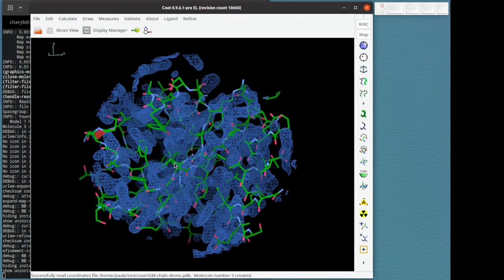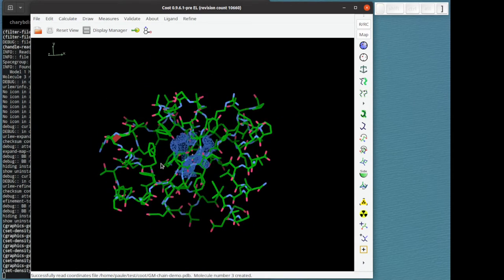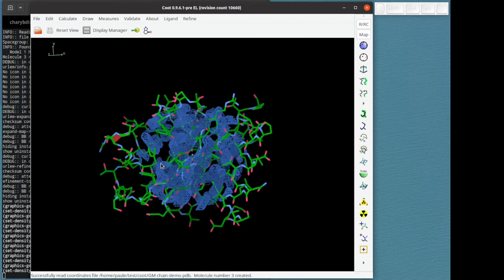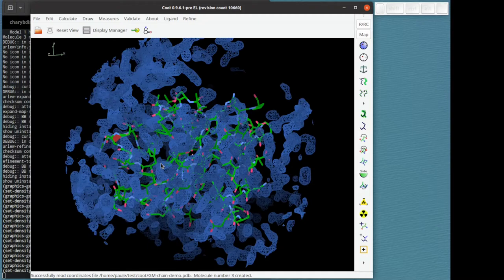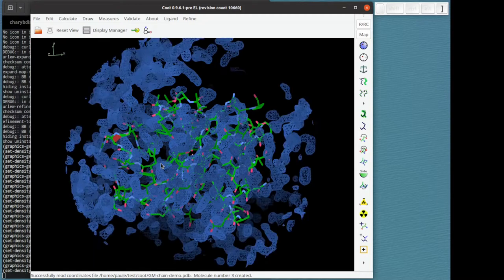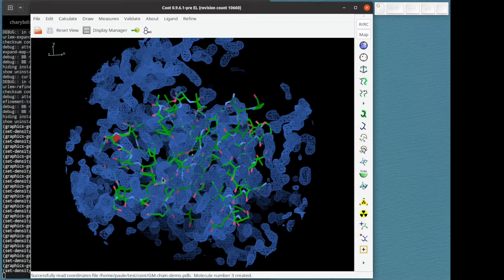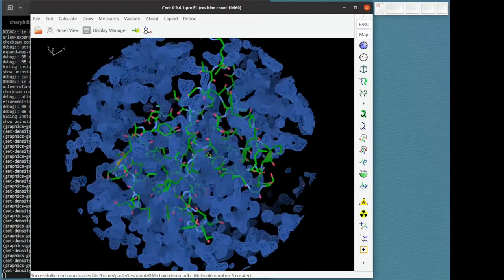Expand map radius has activated the brackets, the square brackets I should say, on the keyboard and so when I type them, they change the way the map or the radius at which the map is represented.